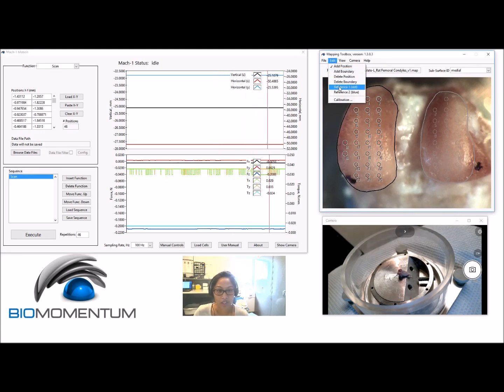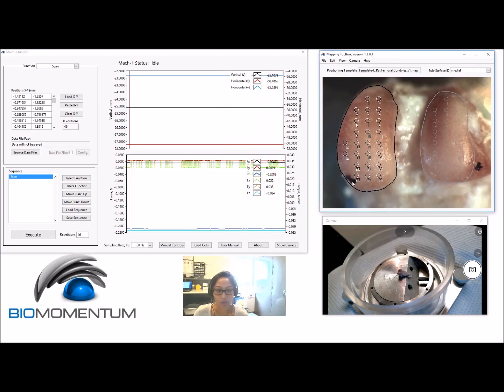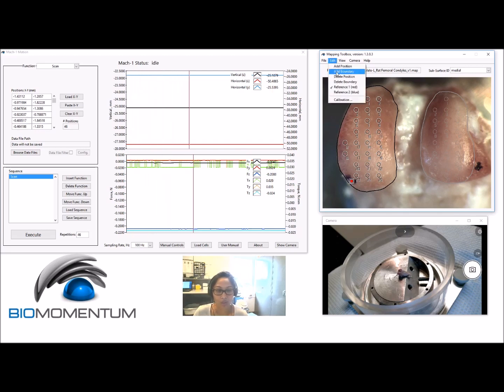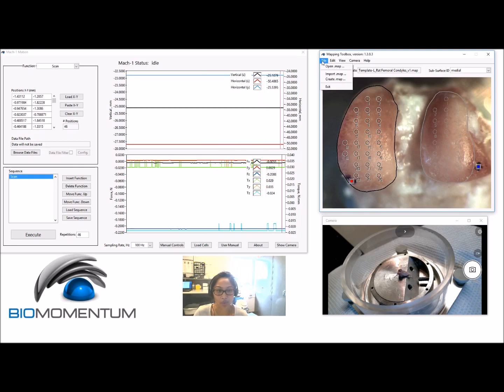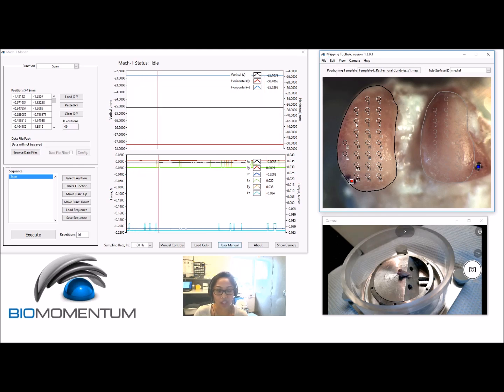Add reference indicators on the two reference marks previously created. Choose Reference 1 in the Edit menu and click in the camera feed at the first reference mark. Choose Reference 2 in the Edit menu and click in the camera feed at the second reference mark.